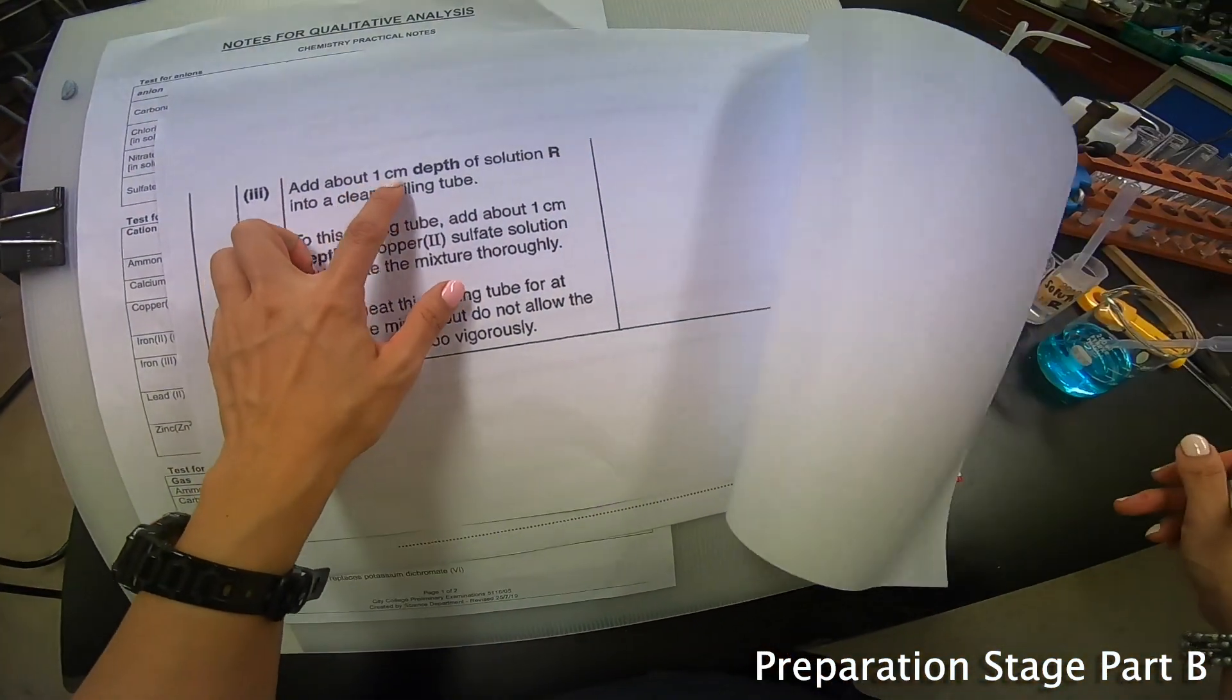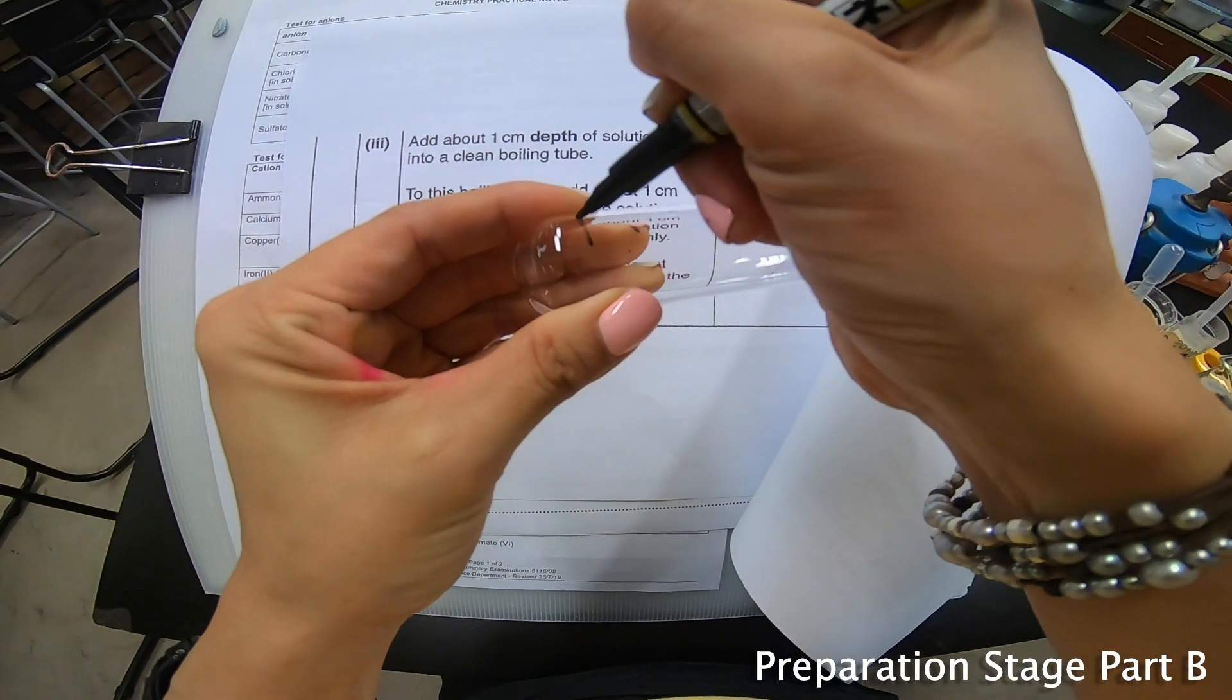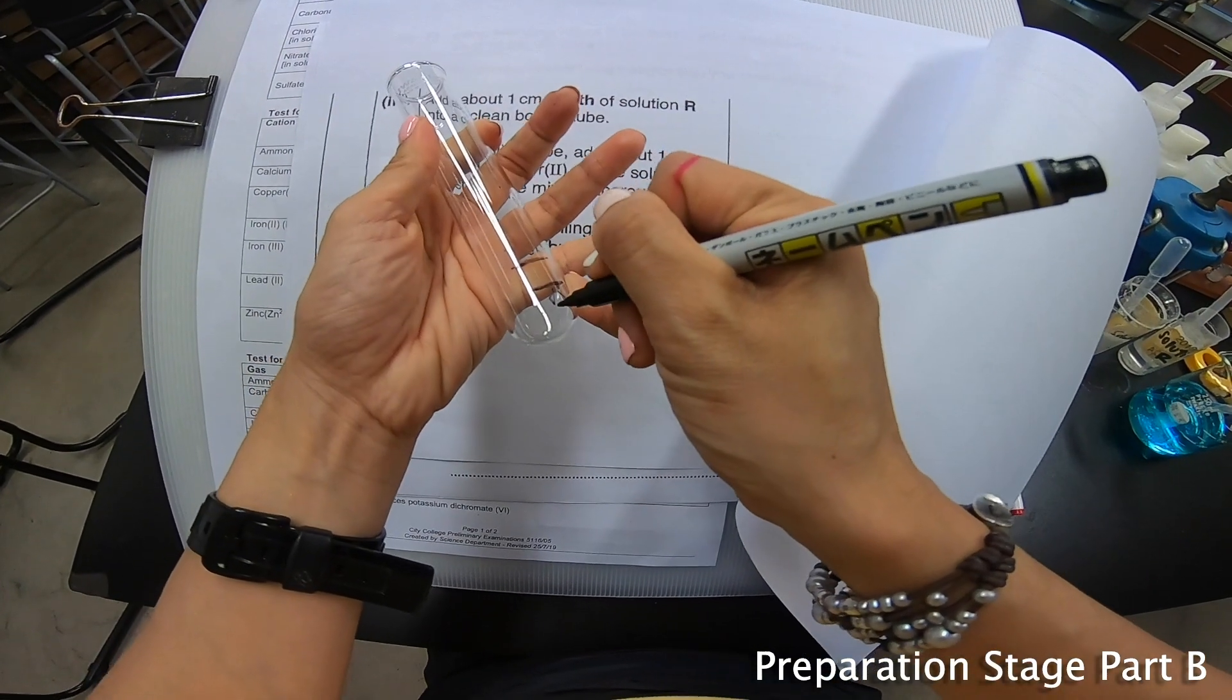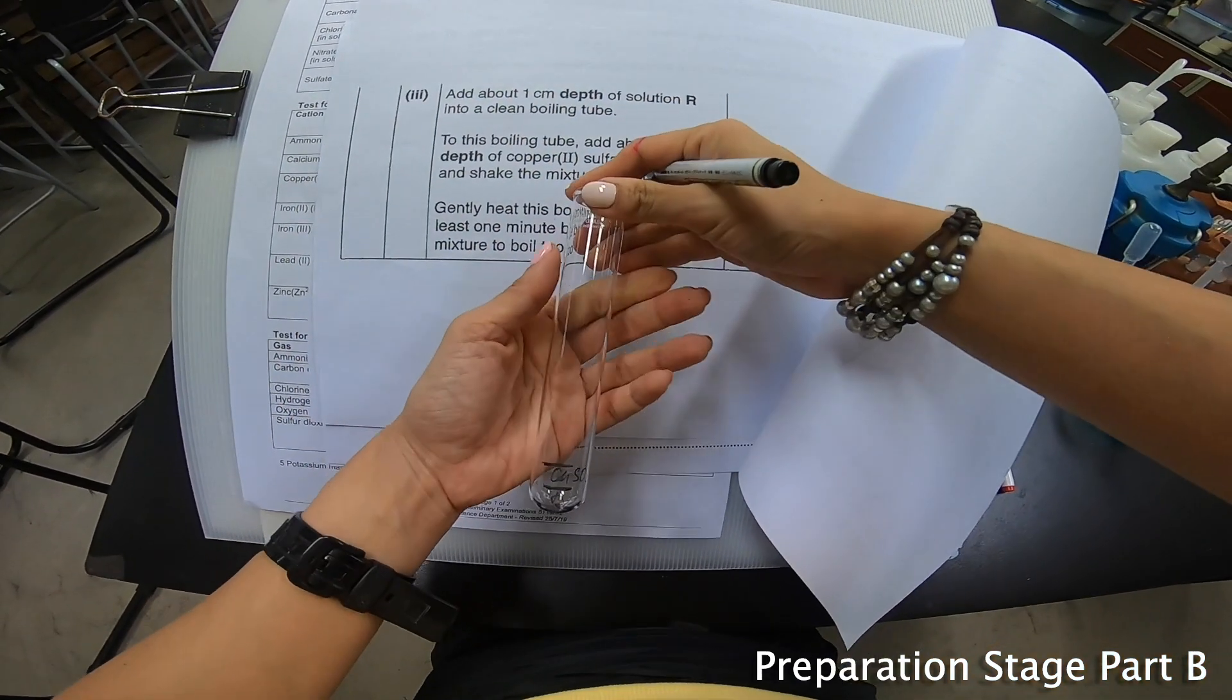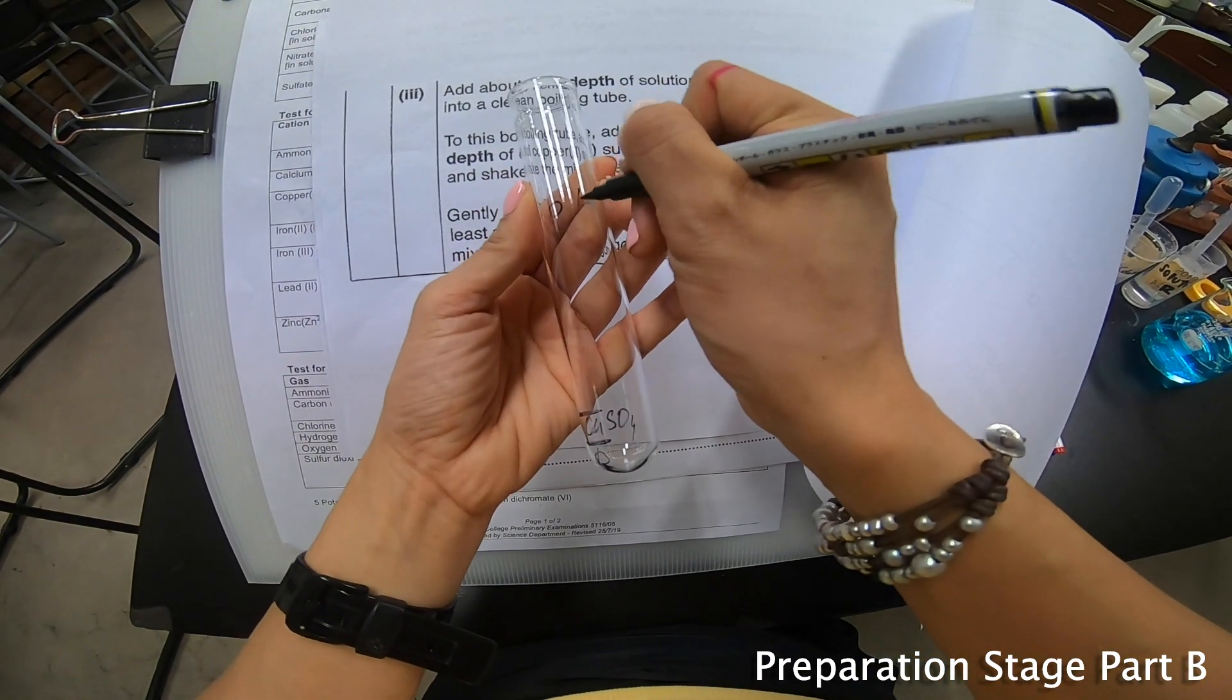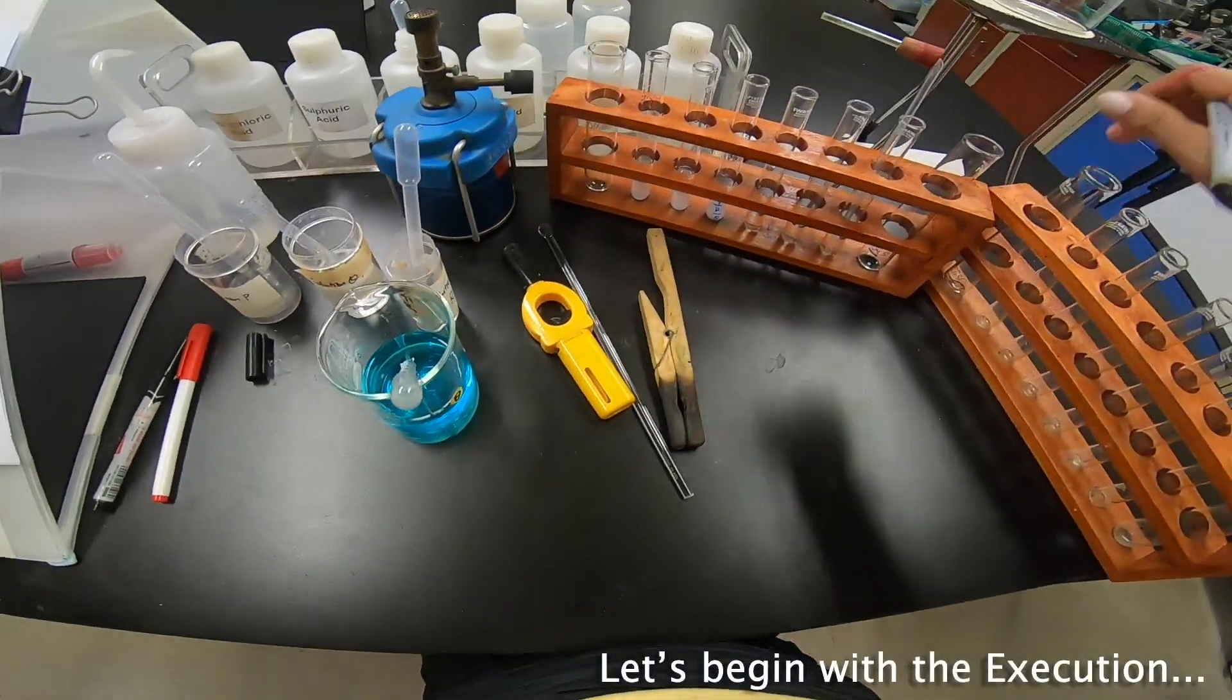Now to the next part here, say add about 1 cm depth of solution R into a clean boiling tube. Now this is a boiling tube, 1 cm. Another 1 cm. And then this is R, and then this is CuSO4. And then I make sure I add in, label it as B part 3. So I've labeled everything. So let's begin the entire experiment.